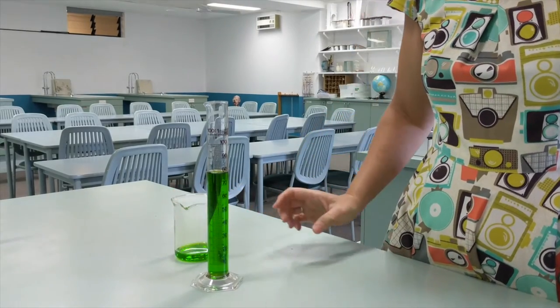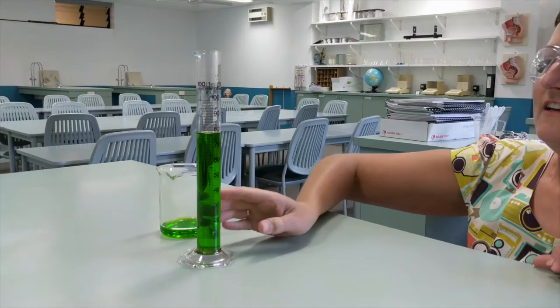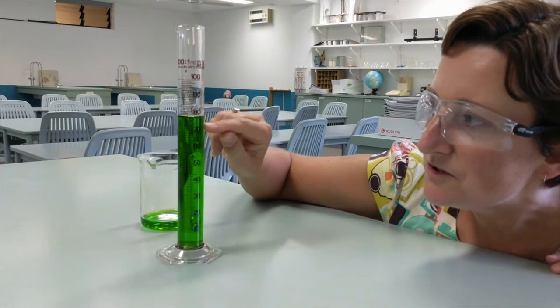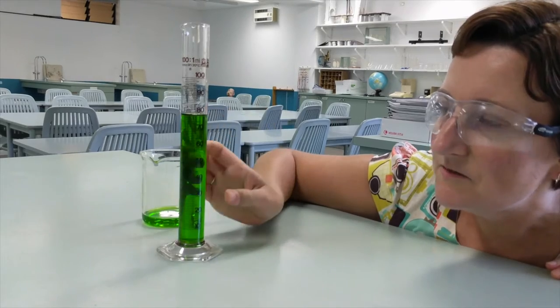Now we need to fine tune that volume. In order to do that we need to get down to eye level. We need to make sure the bottom of the meniscus is lined up with the scale mark of the volume that we want.